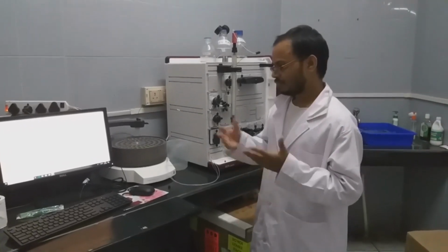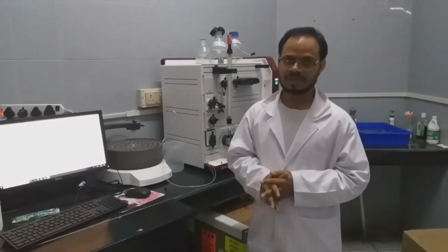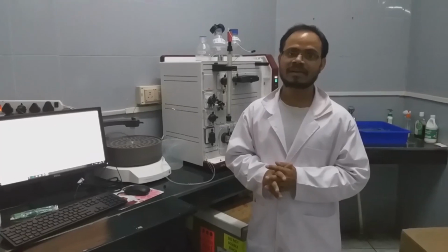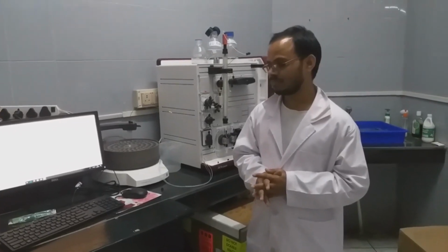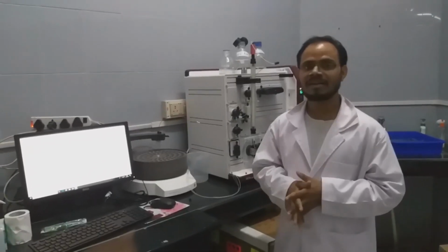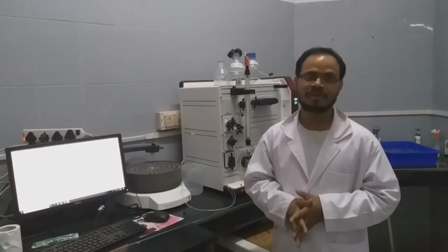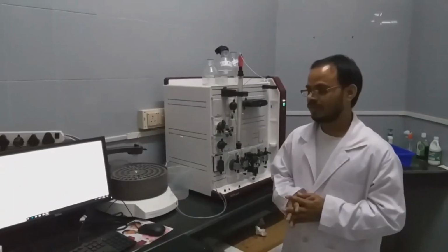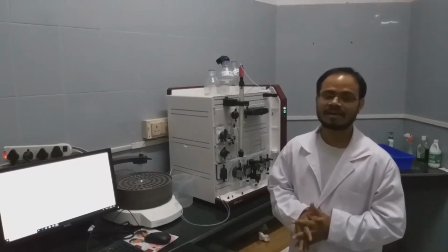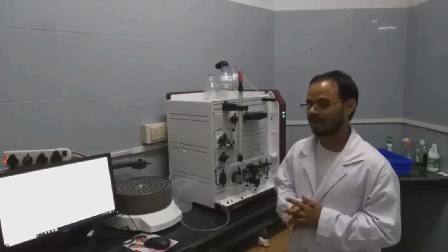So this also helps good resolution and keeps the structure of the protein intact. Indirectly, we are providing similar conditions for the protein, so it will behave in a native condition. So we completely washed out the ethanol that was present inside the column. Now we will equilibrate in the phosphate buffer.